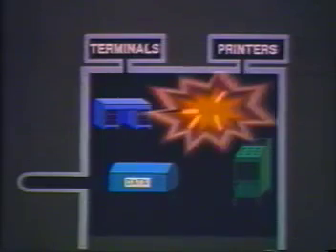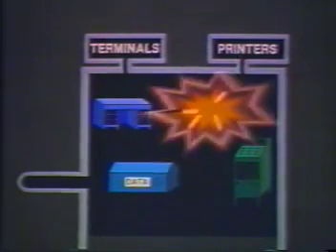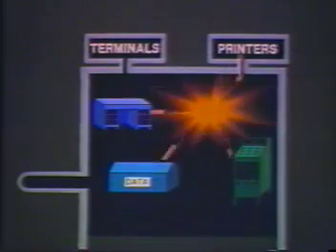To run FACS Desk, you only need to learn a few commands for manipulating the drawers on your desk, and a few more that will allow you to communicate effectively with the Magic Secretary. Now that we've shown you a little bit about how FACS Desk is organized within the computer, let's return to the real world and watch the Magic Secretary's press-to-digital skills at work.